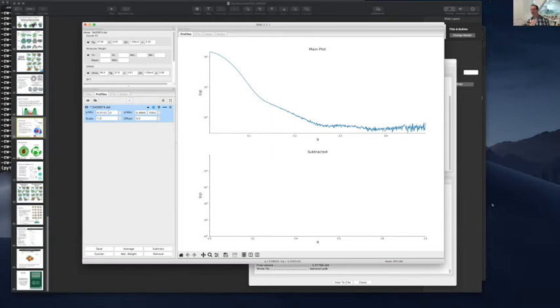The only downside of that is that any updates and bug fixes are only going to be available in the actual open source version of DENSS until Jesse updates Raw. So that's the only downside, but it's really great because you can get it to work right within Raw.